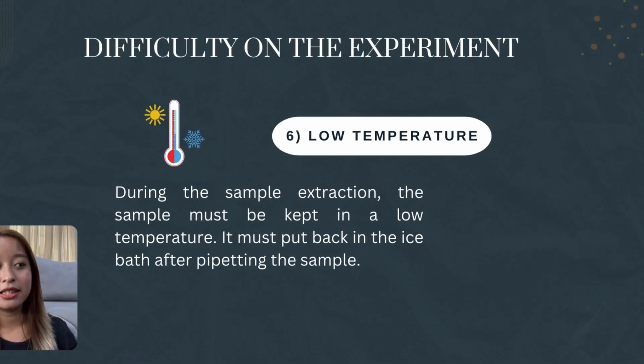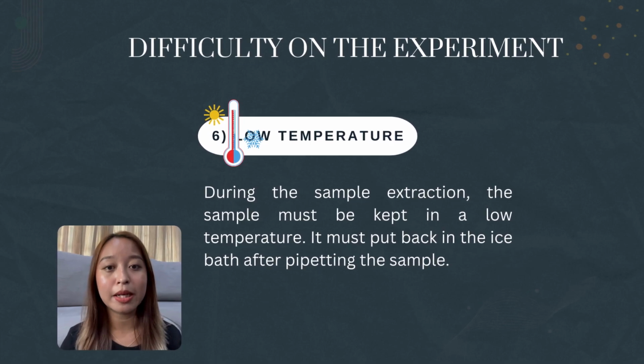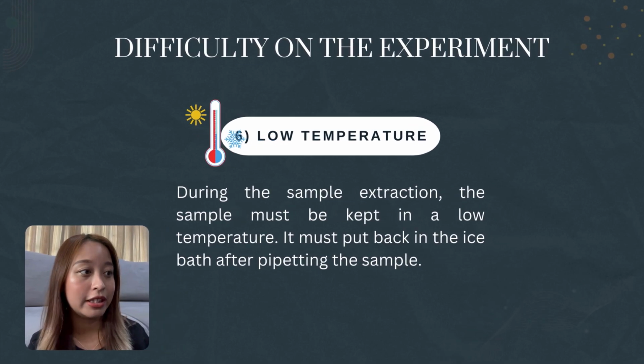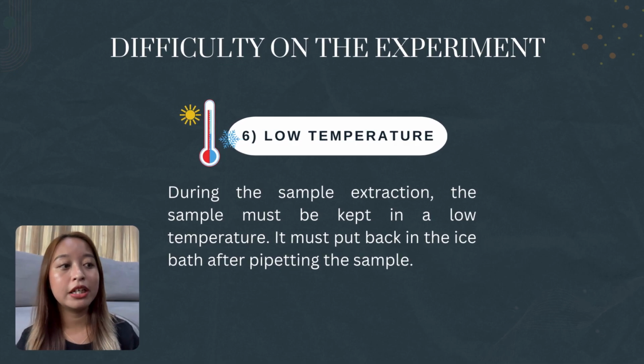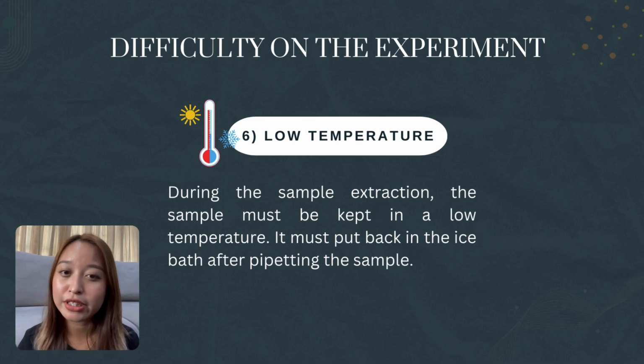The last one is maintaining a low temperature of the sample. During the sample extraction and pipetting, the sample must be kept at a low temperature. It is to make sure we put the sample back in the ice after pipetting every time we use it.